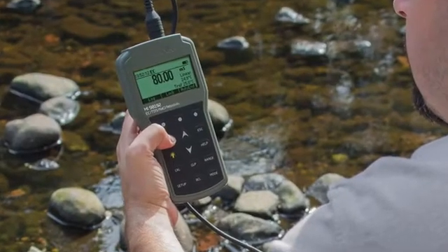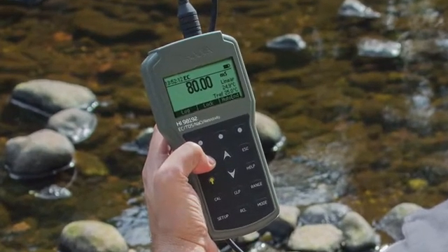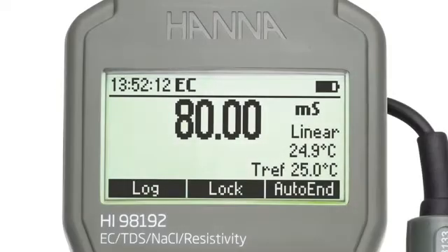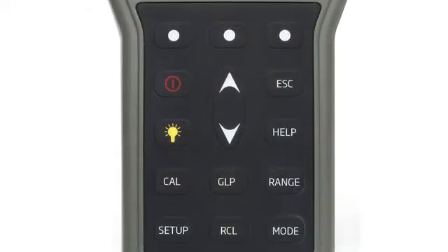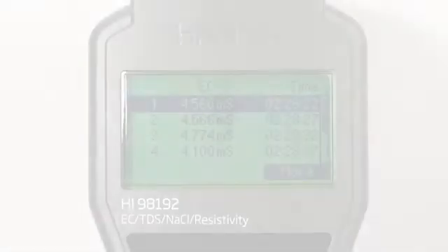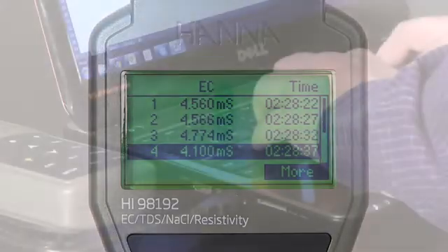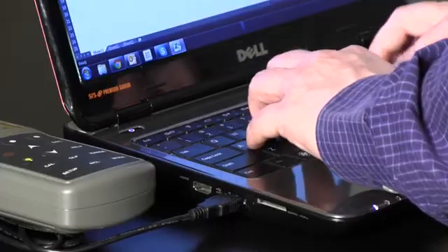This user-friendly ergonomic waterproof meter is built to withstand the harshest of environments while maintaining benchtop level performance. The meter features a large backlit dot matrix display and dedicated keys for calibration, setup, GLP data, and contextual help. Logging data is made easy with a simple press of a button, and logged measurements can be transferred to a PC using the supplied Windows-compatible software and USB cable.